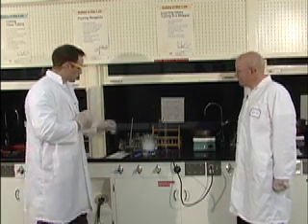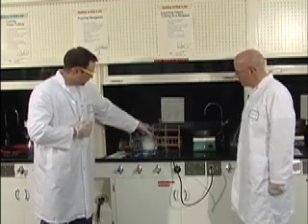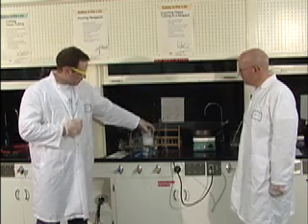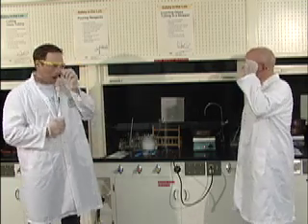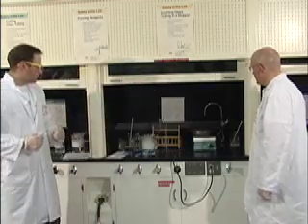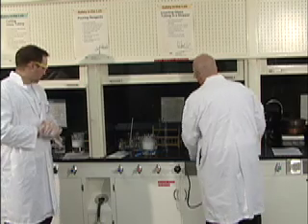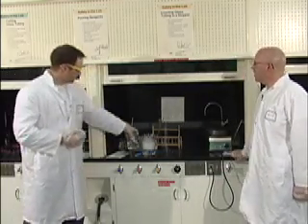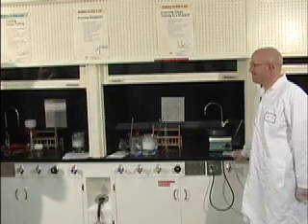Anyways, as we were saying before, Sherry has already done this for us, so we have our beautiful needle-like crystals already formed in the bottom of our beaker. Now the trick is how we're going to get them out of there. Actually, we'll turn this off. There's a really easy way to get the crystals out of that beaker, and we're going to use something called vacuum filtration. Okay, can we switch fume hoods here? We'll go over here.